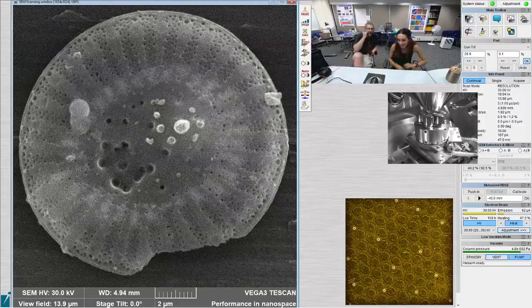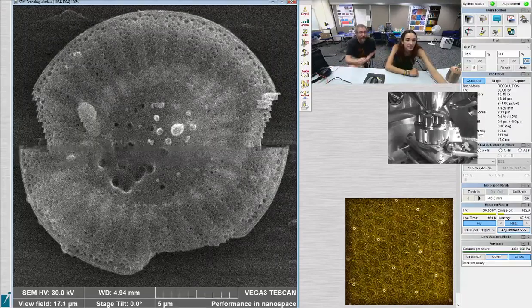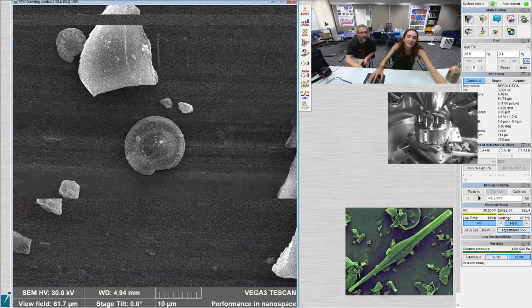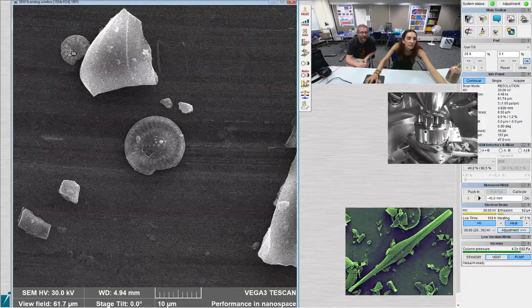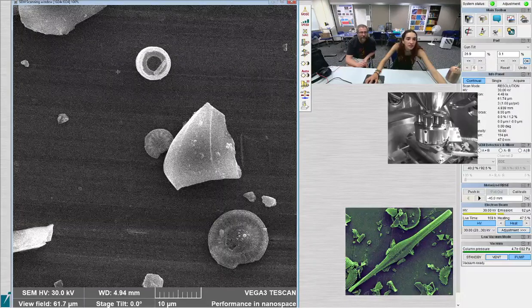I would like to do it on something where we have an internal view so that we could look at the detail a little bit better. So there's another diatom right there. And another one. I'm in girdle view, right? Yeah.